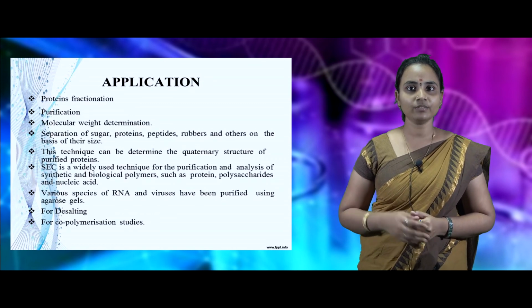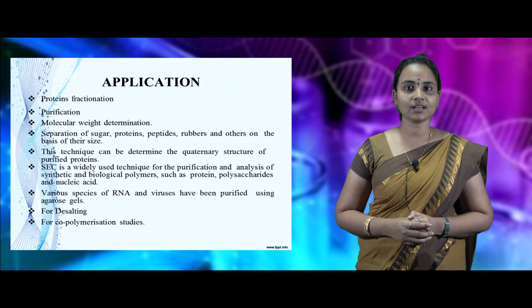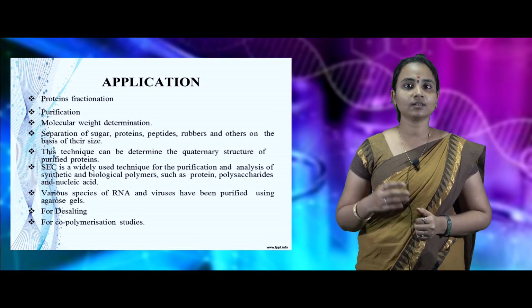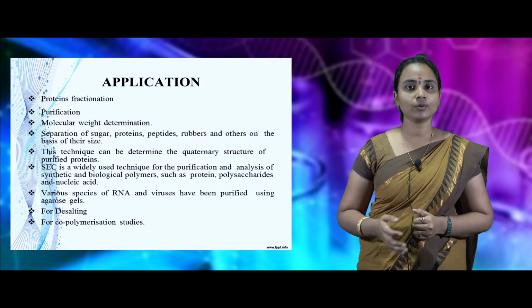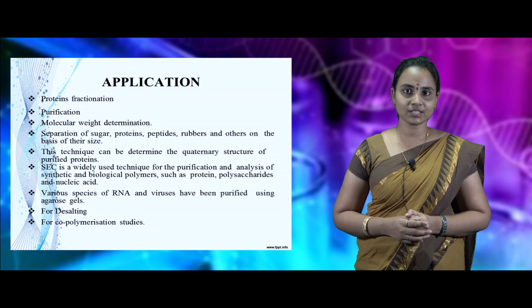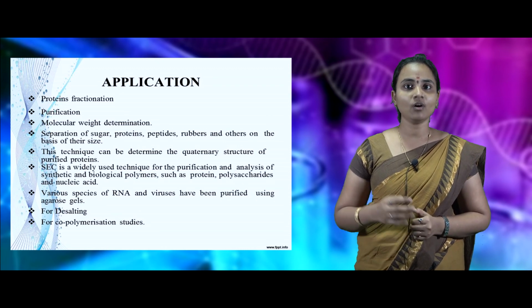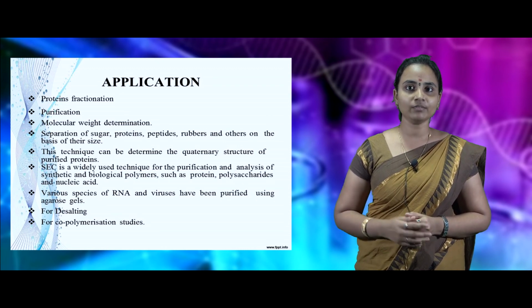Coming to the applications of size exclusion chromatography, there are vast applications available. The chromatography can be used for protein separation, protein purification, and also for copolymerization studies, and it can also be used for desalting studies. It can also be used to determine the molecular weights of different proteins.